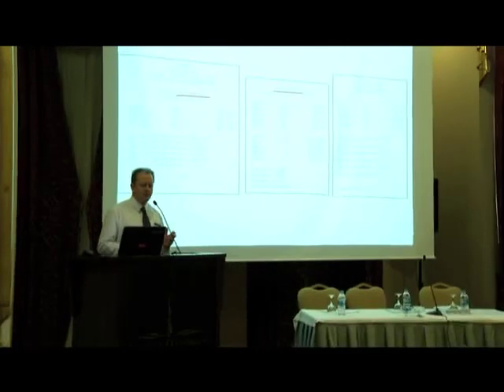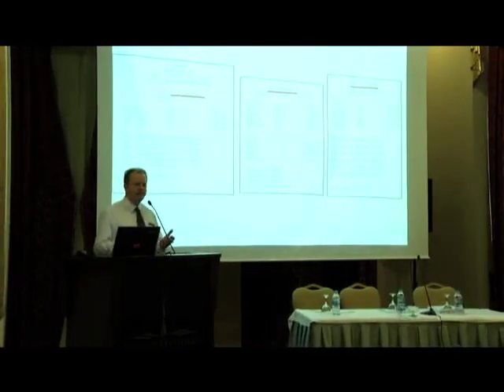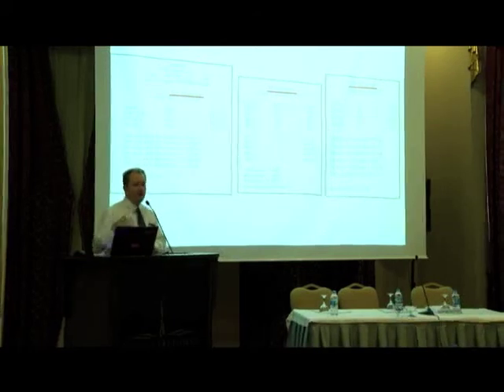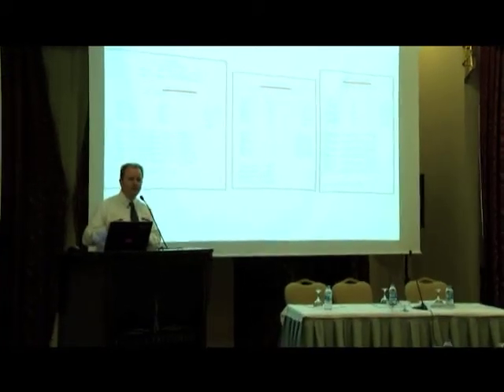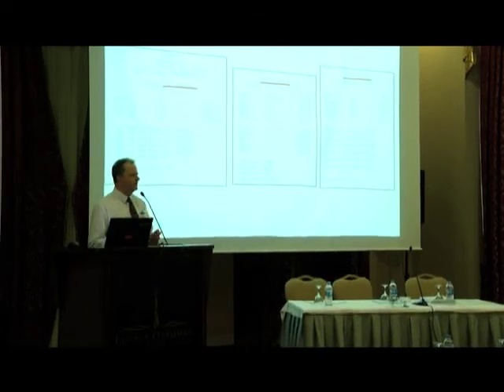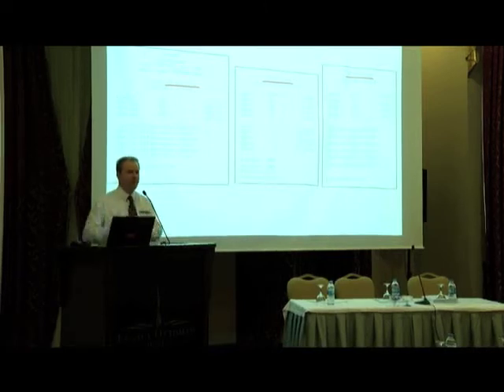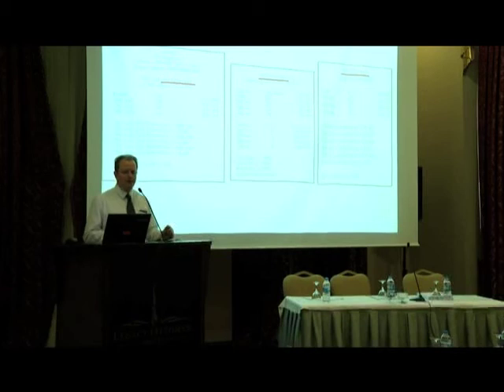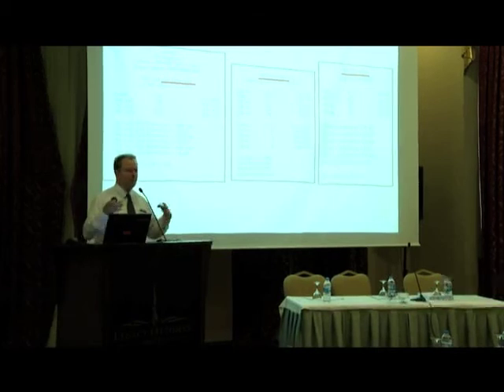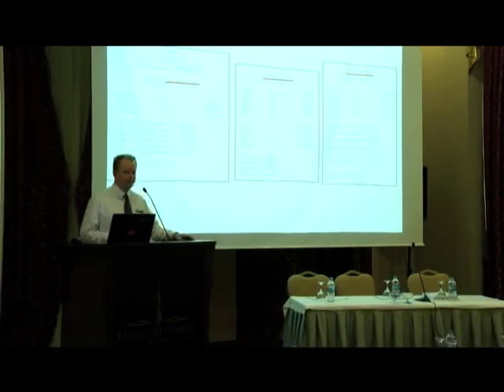The next thing we would do is a calibration of the analyzer, and the last thing we do is we do again a check to make sure that the calibration procedure we have just performed has worked effectively. So we check the analyzer was working when we find it, we calibrate it, and then we check it when we need to make sure everything is okay. In this way, we can be confident that the water quality in our manufacturing plant is going to be within compliance.